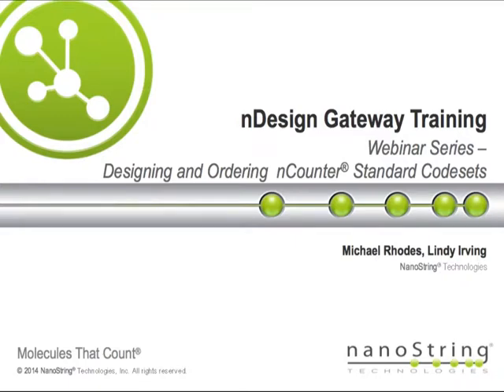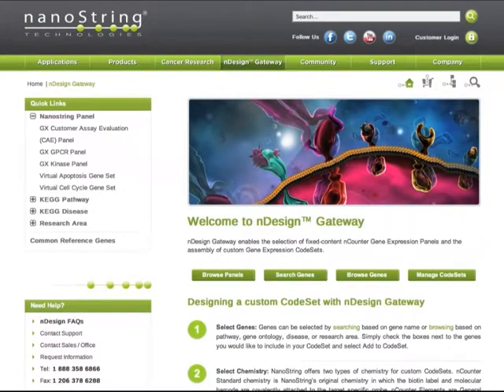In this webinar I'm going to cover how to use nDesign to place an order for a standard code set. There are other webinars that cover the elements ordering process, as well as a quick start webinar that takes you very quickly through the main aspects of the site. So with that, let's start this webinar, and I'll assume you're on the nDesign webpage.